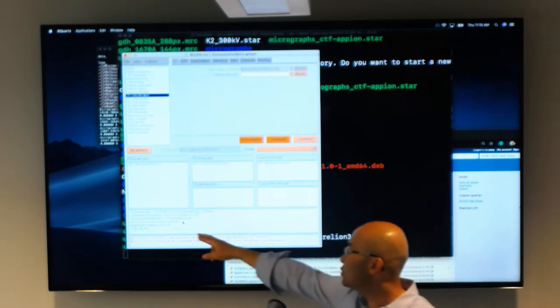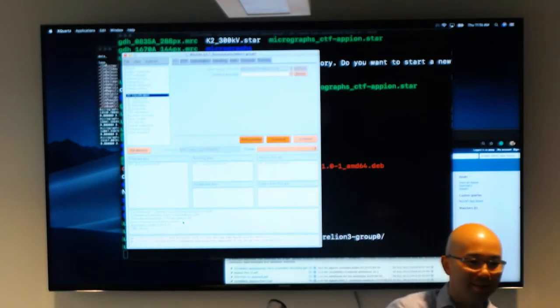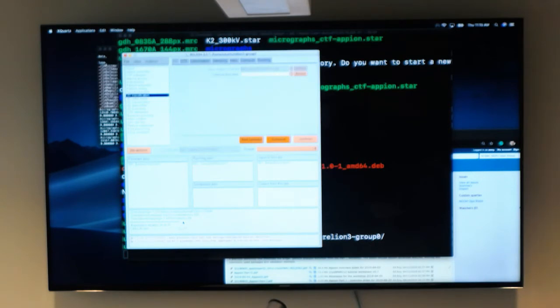Normally, as you can see here, this iteration is moving, right? The number is changing, and it's moving forward. But if it's an error like that, then it probably stopped. With this error code, it's not running.